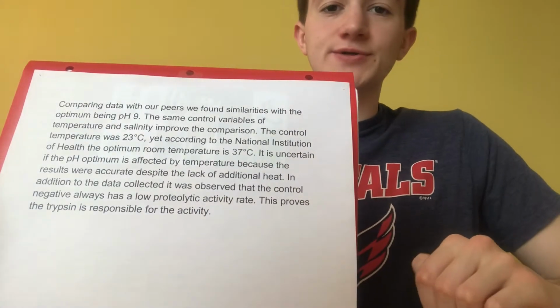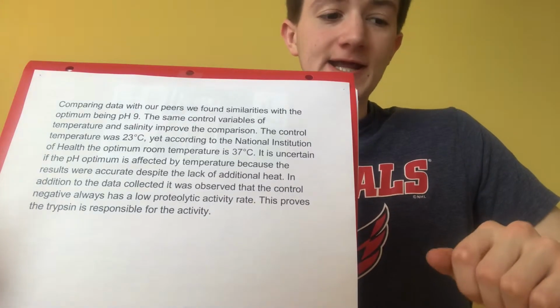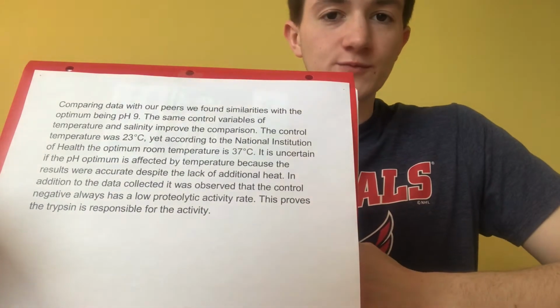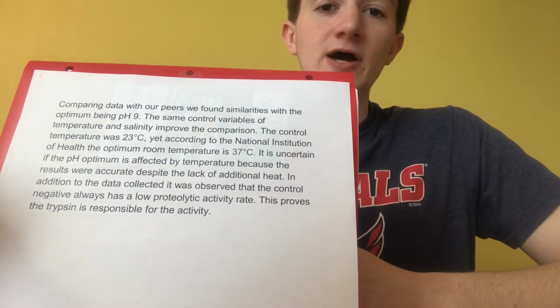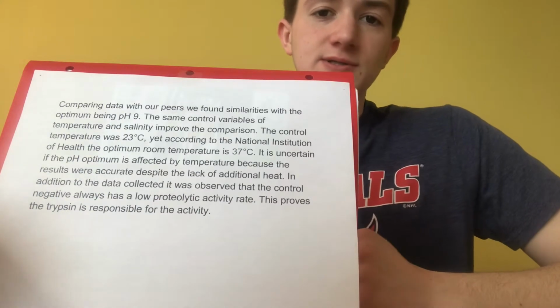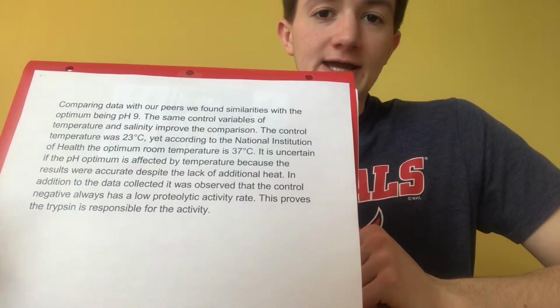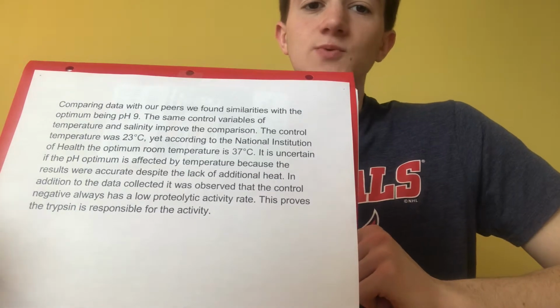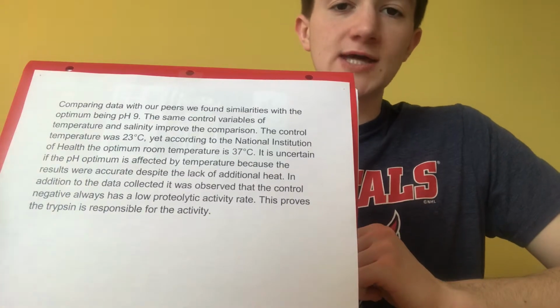Other groups also found that the optimum pH would be pH 9, and similar to our experiment, they had control conditions of room temperature and a salt concentration of 0.15 molarity. We had a room temperature of 23 degrees Celsius, but the National Institutes of Health suggested that an optimum temperature would be 37 degrees Celsius, which may have increased the activity of trypsin on the azocasein.